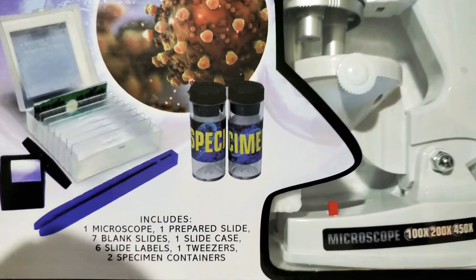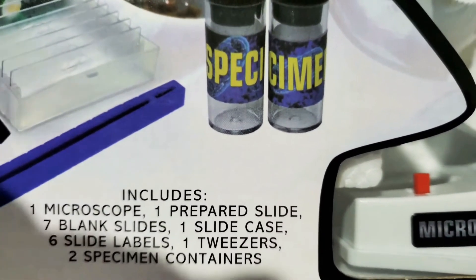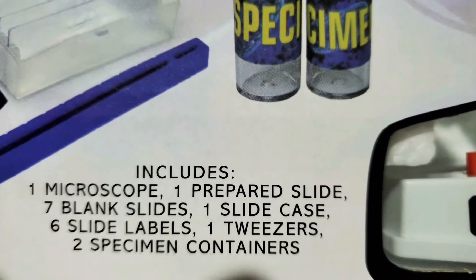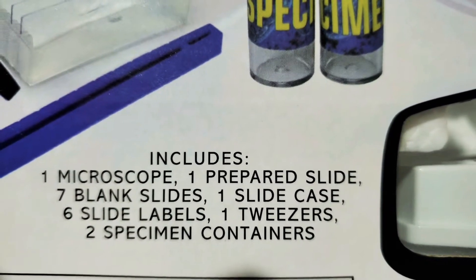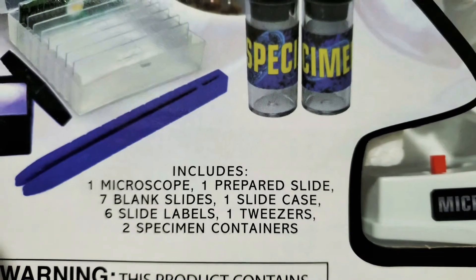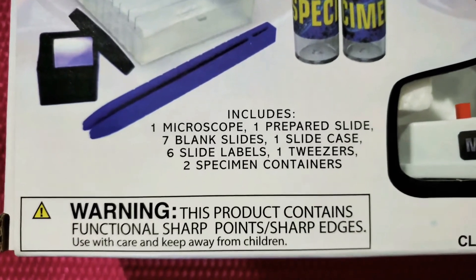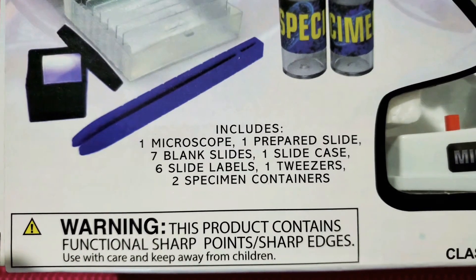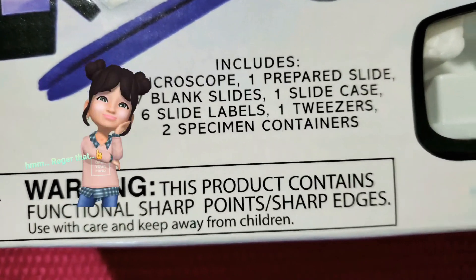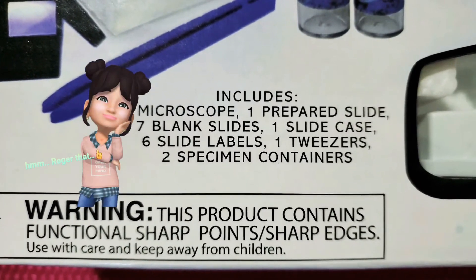It includes one microscope, one prepared slide, seven blank slides, one slide case, six slide labels, one tweezer, and two specimen containers. And don't forget the warning — this has sharp points and sharp edges, so don't get this for young children.